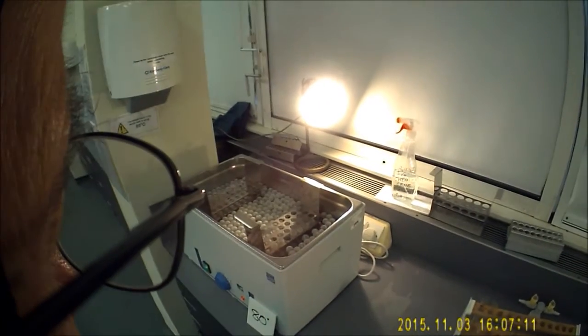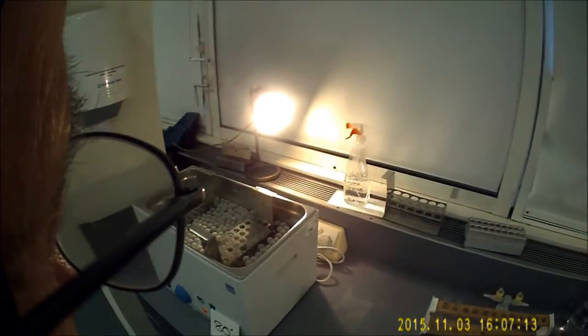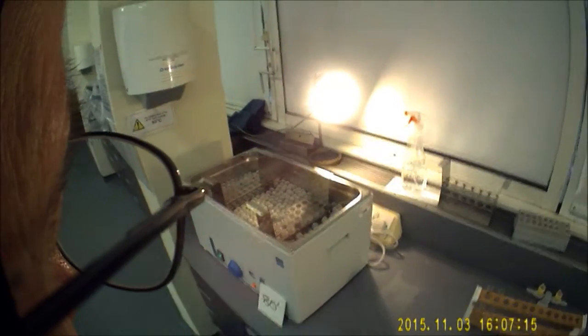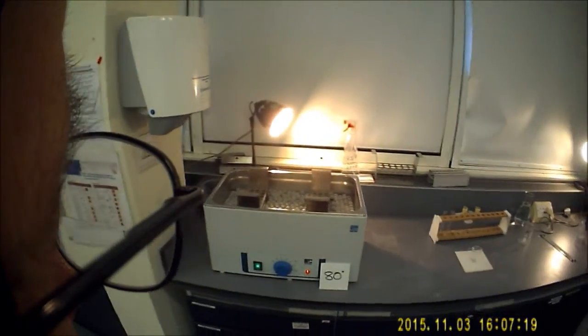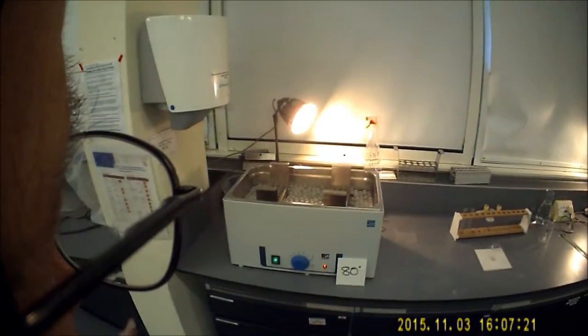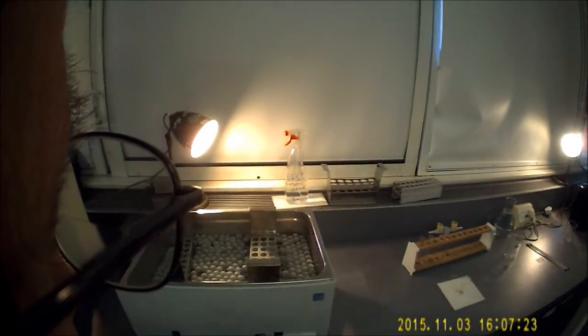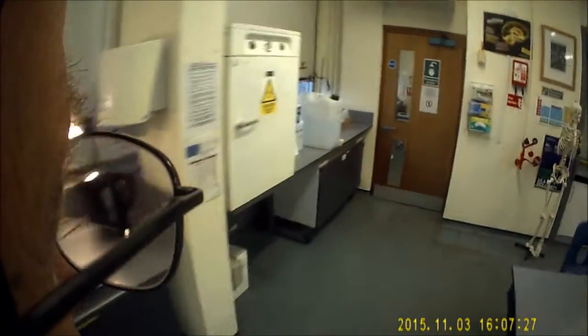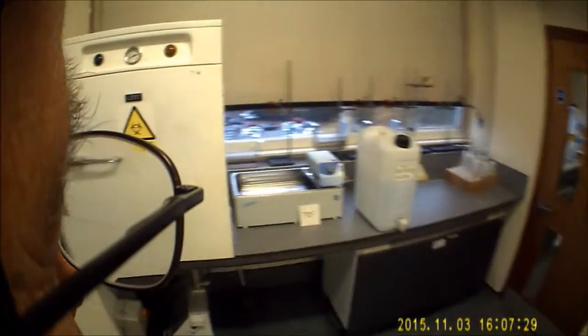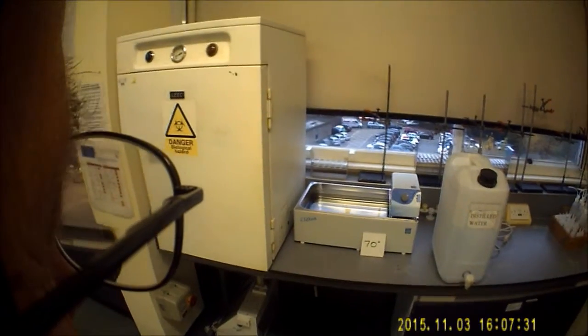Let's imagine that one of the temperatures that you've been given to work with is 80 degrees. We've set up one of the water baths at 80 degrees — it's probably going to be the big one, which is the one on the left-hand side. The other water bath is if you have to do a sample with 70 degrees.